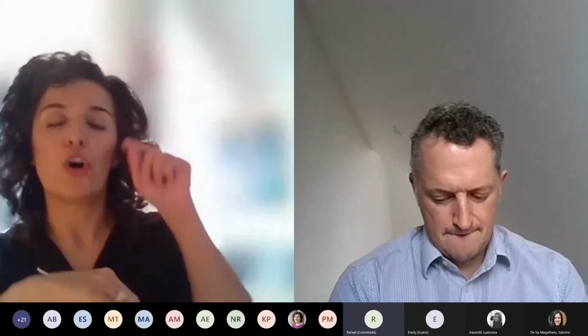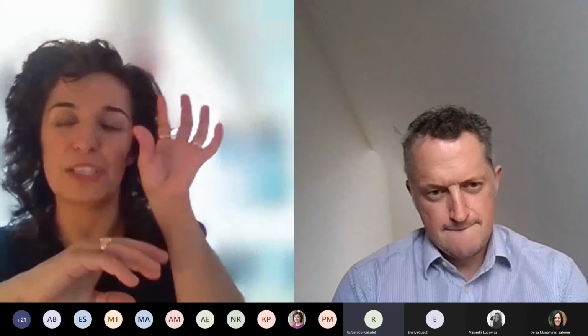And we have taken it even a step further than that. We've taken a grid square, so an area to image on the grid, that we know is well stained, right? So decent staining. And then we can use that as a sort of template matching. We tell the software to go and find areas that match this image within a certain percentage. So you can say only ones that match 90% plus, only go and take images and do the analysis there. You can also lower that threshold, so you have control of it, because some people can be extremely stringent and others not.